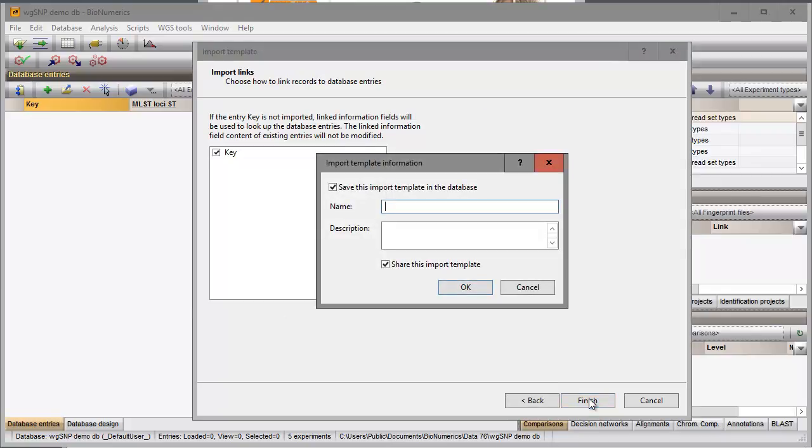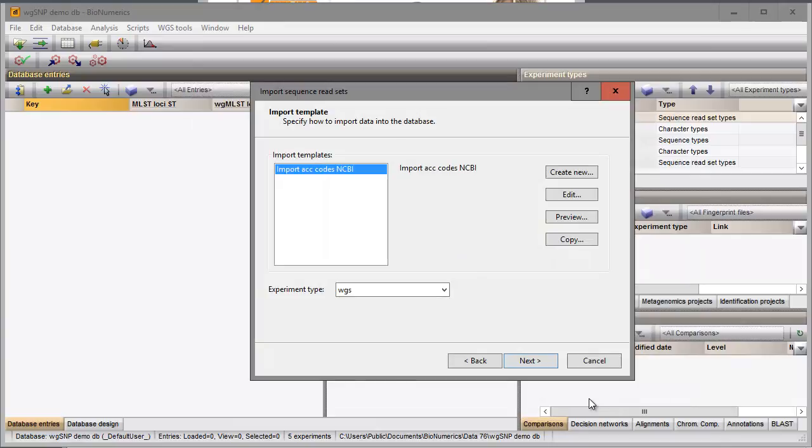I specify a template name so I can use this Import Routine again for future imports. My Import Template is automatically selected in the grid and I make sure my WGS Reset Experiment is selected for the storage of the data links.